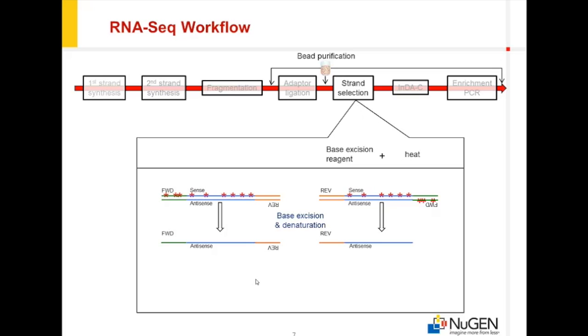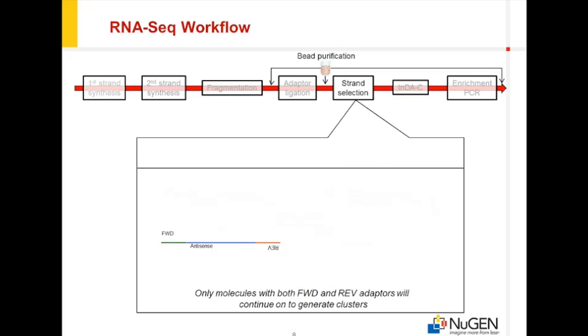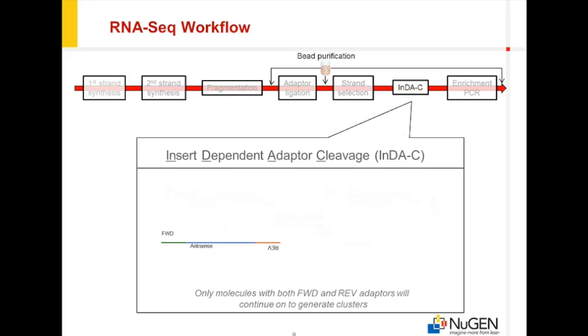And now comes the InDA-C step, or insert-dependent adapter cleavage. At this point, you have molecules with intact forward and reverse adapters, and you have a range of different types of molecules, as shown here.